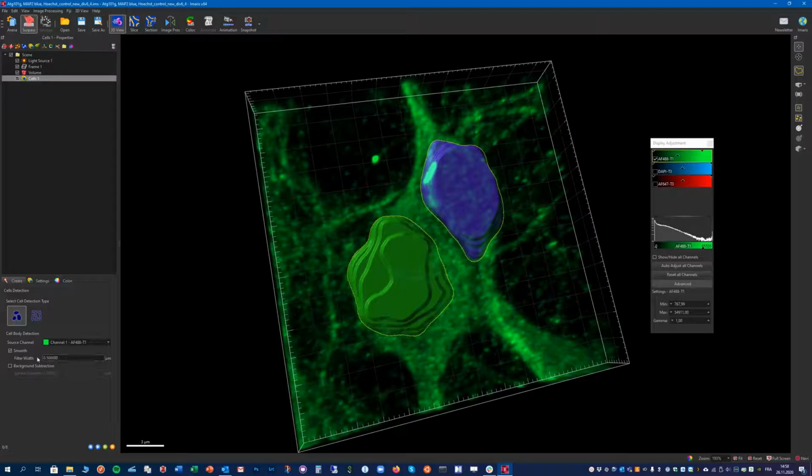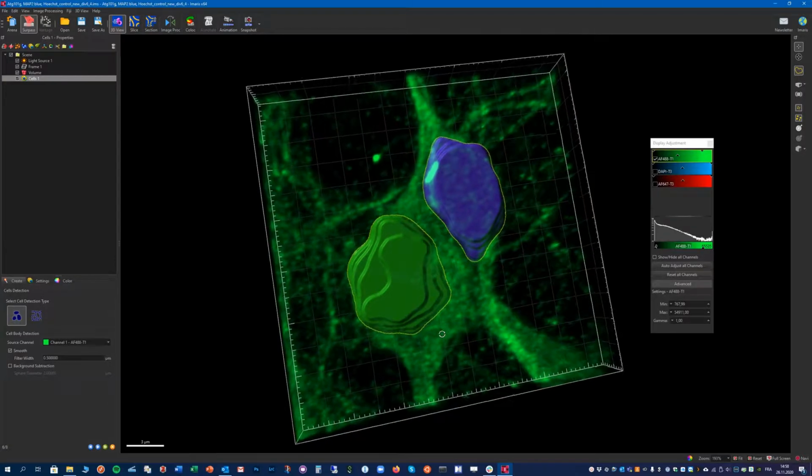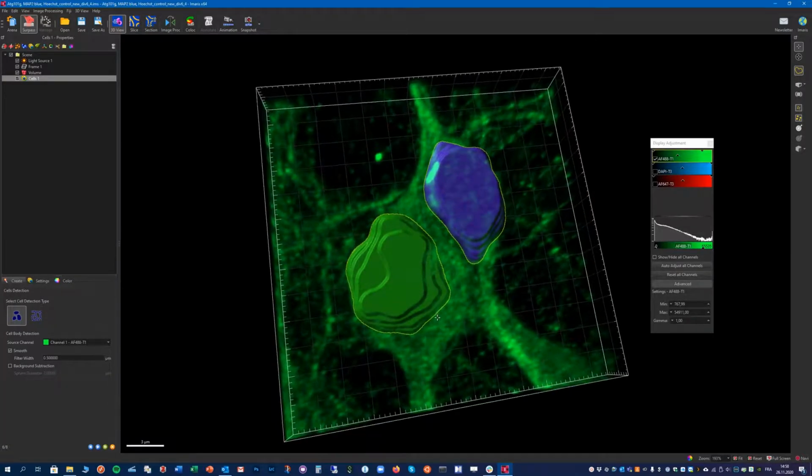Here I will leave those parameters at default for the moment, and I will also not do any background subtraction, since the green signal is made of dots, and you might enhance the contrast instead of making sure everything is homogeneous, which is needed for the algorithm to work correctly. So just leave this out.